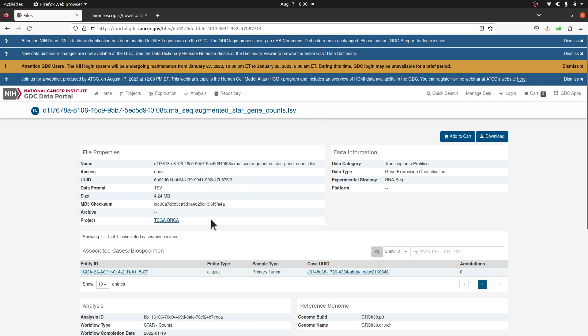This gives us extra information about the data we selected or clicked. I need the file ID which is this one here - UUID. This is it, so I'll copy it.